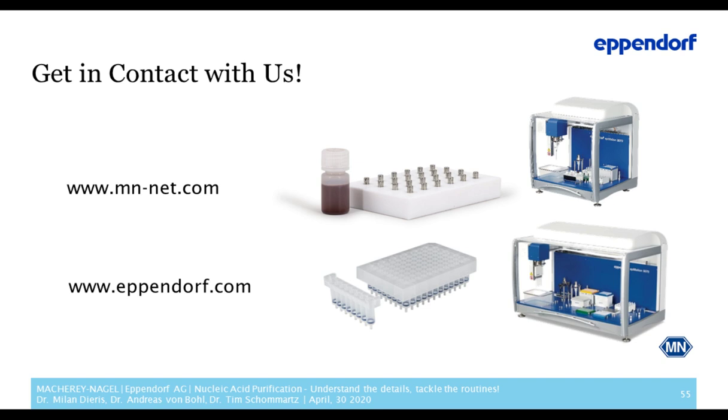Andreas, let's stay with you for this question as well. How can we avoid foaming in nucleic acid purification using silica? The foaming is a typical issue which comes up with detergent-containing buffers during vacuum processing. In our kit there's a certain wash buffer with a high concentration of ethanol, but you can also use 80% ethanol, and we just perform an overlay step. Before applying the vacuum, you add 150 microliters of 80% ethanol on top of the sample, and then you apply vacuum, and thereby you get rid of all the foaming.